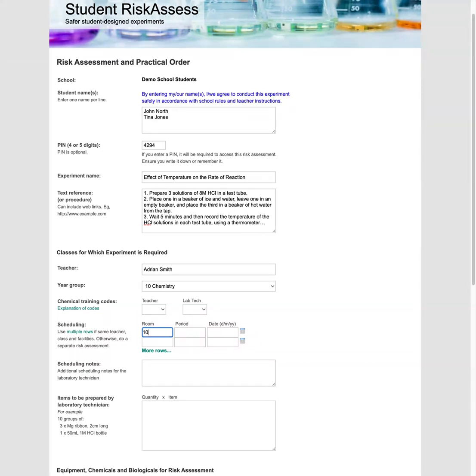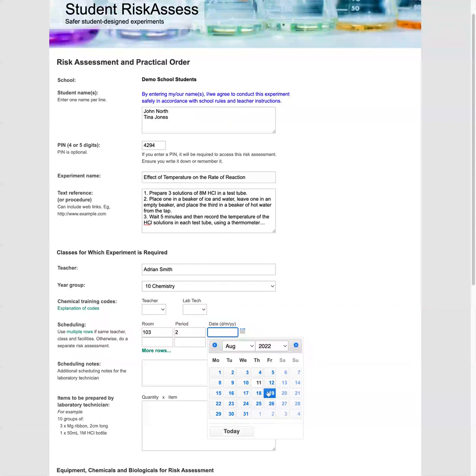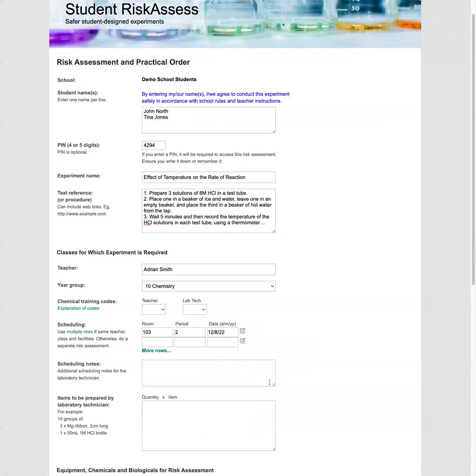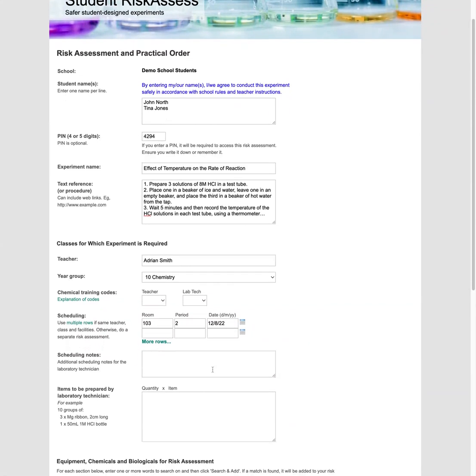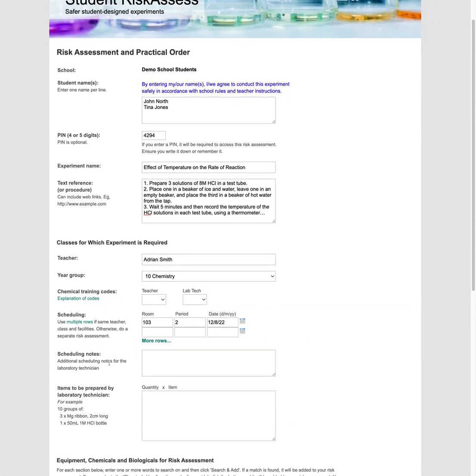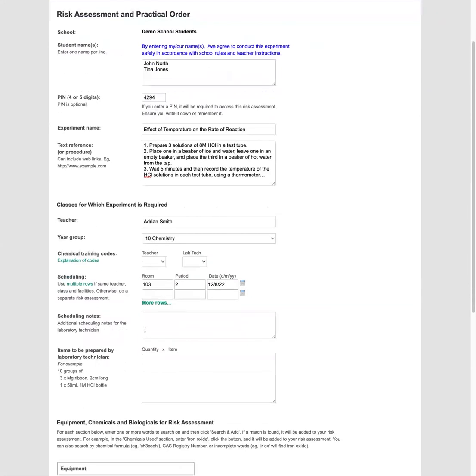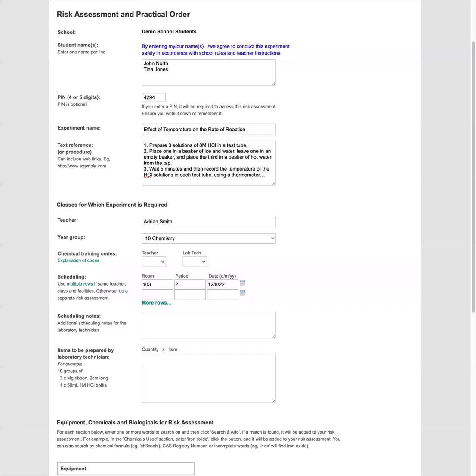Since this is just a one period prac, we'll enter it in. So room 103, period two, and the date is going to be on tomorrow. You can also enter in any additional notes for the lab tech here. And then we come to the items that we're going to ask the lab tech to prepare for the experiment. So we've got eight molar hydrochloric acid, ice cubes, and magnesium ribbon.